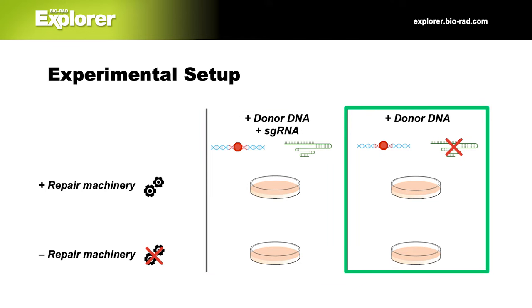First, label 4 tubes A, B, C, and D, and put them on ice. For the best results, be sure to keep your tubes on ice anytime you aren't working with them. Add 250 microliters of cold transformation solution to each tube, and then put the tubes back on ice. Use a loop to take 5 colonies from your starter plate without arabinose and add them to your A tube.